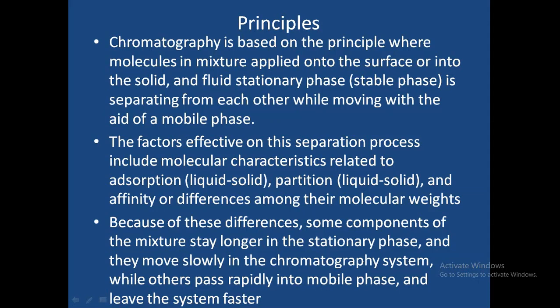So depending upon the partitioning coefficient of the compounds between the 2 phases, mobile phase and stationary phase, the separation is achieved. The factors effective on this separation process include molecular characteristics related to adsorption, partition and affinity or differences among their molecular weights.